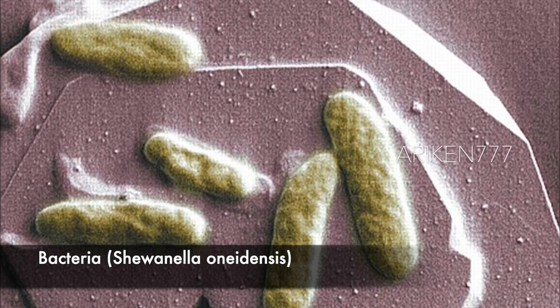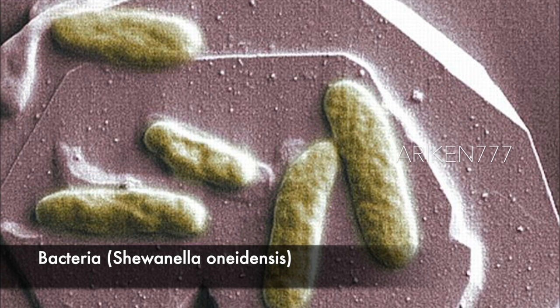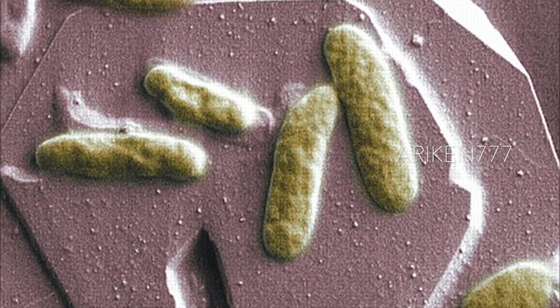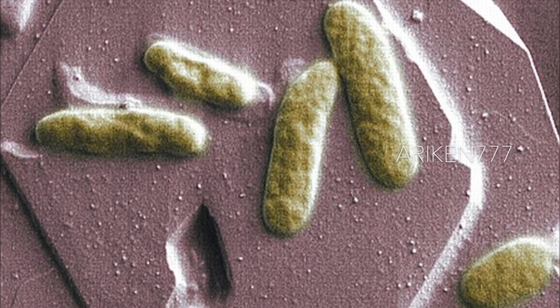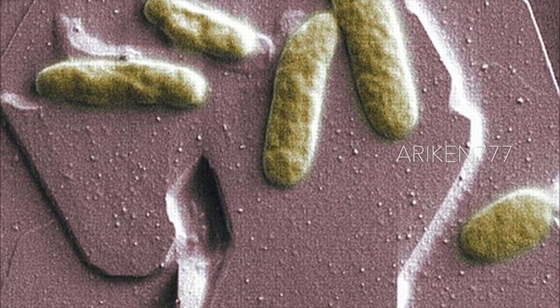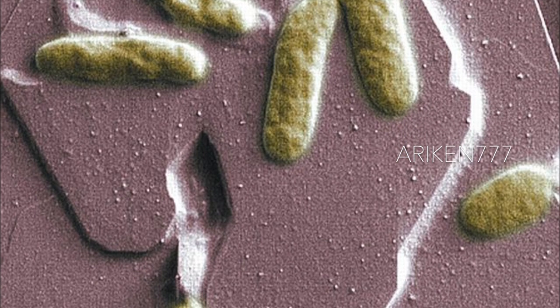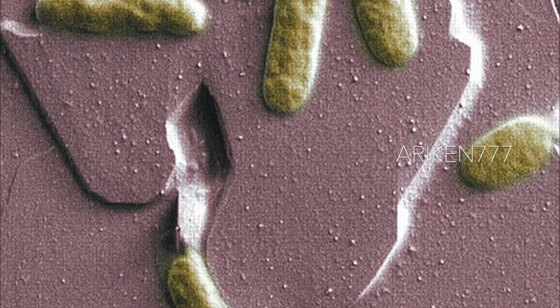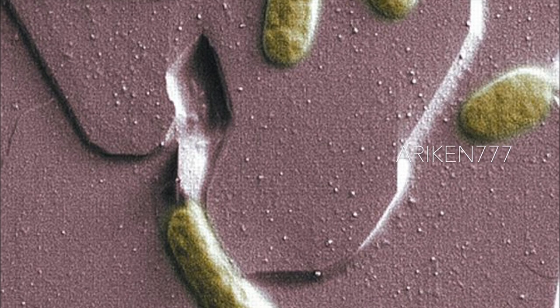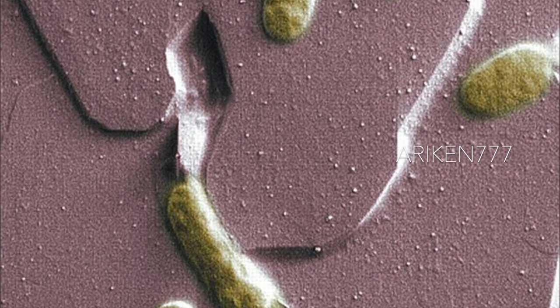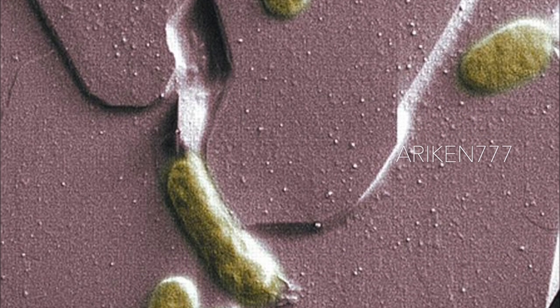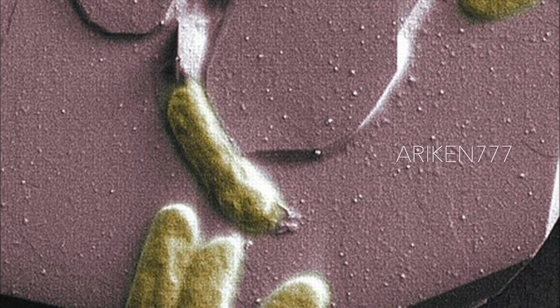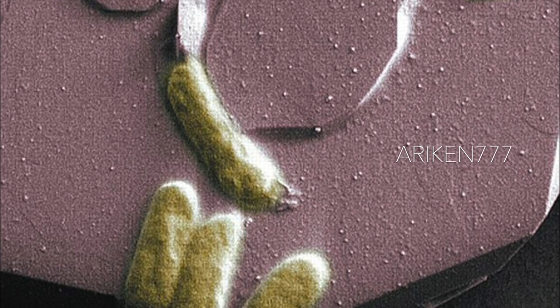These rod-shaped structures are metal-reducing bacteria. These extremophile bacteria are able to convert toxic metals and compounds such as uranium, chromium, and technetium into water-insoluble forms. This ability could one day be used to clean contaminated groundwater.